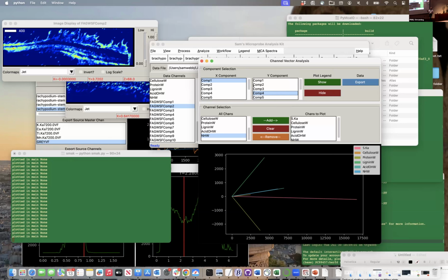And this really shows we need to think a little bit clearer about sample transfers, sample preparation, and orientations. If we're going to do this again on a real sample and really make these correlations, yeah, we can go vertical on the sample and take the extra time, right? And spend the time to take the data correctly, or more adequately, to be able to match that up better. So there are things that we've learned now just in this test data set that are actually going to help hopefully everyone: keep your orientation, keep your hyphae fresh.